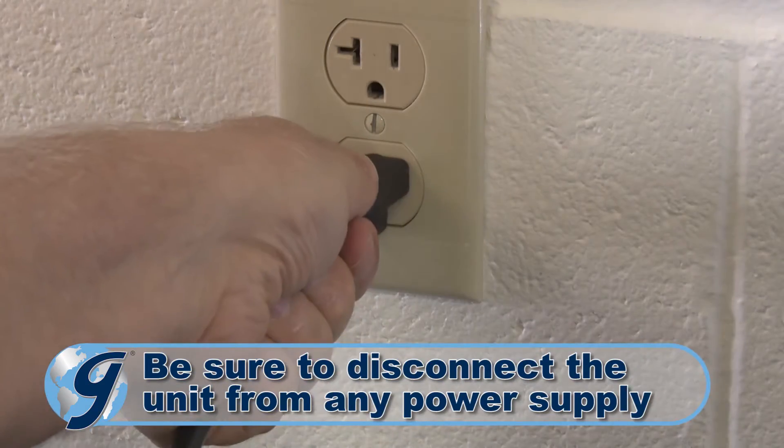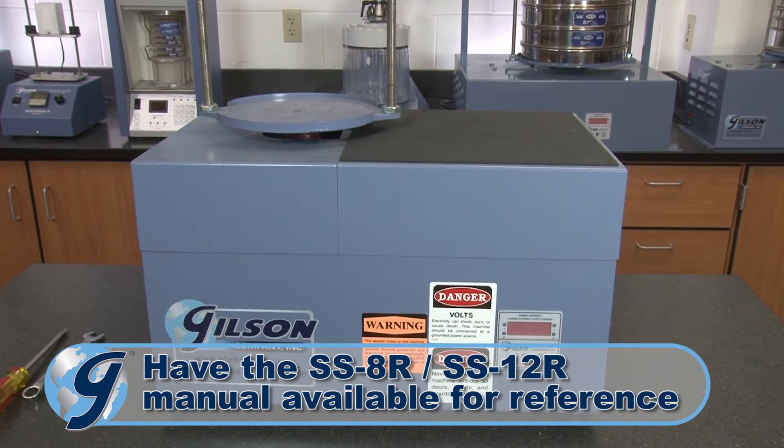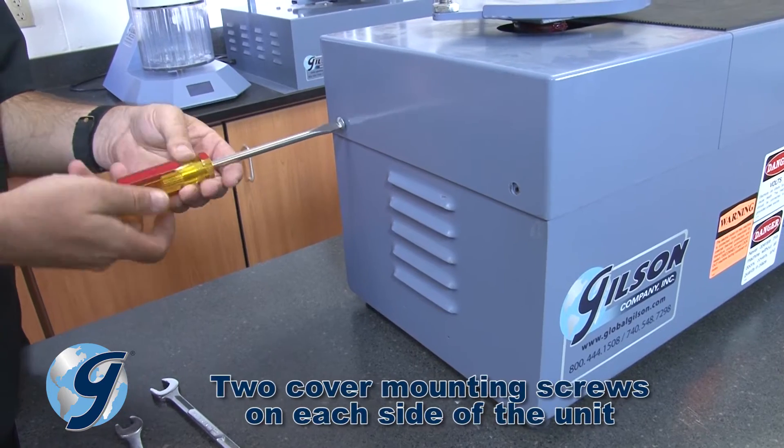First, unplug the unit from any power source. To access and troubleshoot the parts inside the unit, you first remove the left and right case covers. Remove the four cover mounting screws.